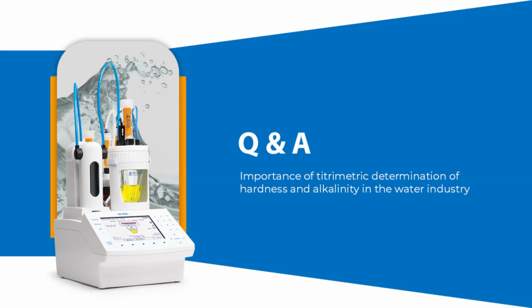Ketan sir has asked, so this COD BOD analysis will be correlation based evaluation. I didn't get your question, sir. Mr. Ketan, you can ask your question. Am I audible? Yes, you are audible. Can you elaborate? You recently mentioned that COD and BOD analysis are also possible with this system. So this analysis will be a correlation-based methodology, or will it be exactly a COD analysis or BOD analysis that has been carried out?